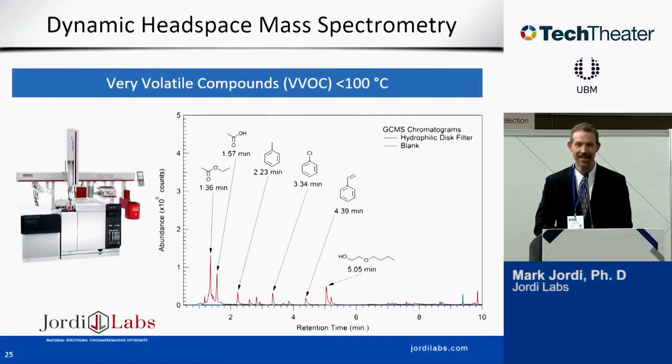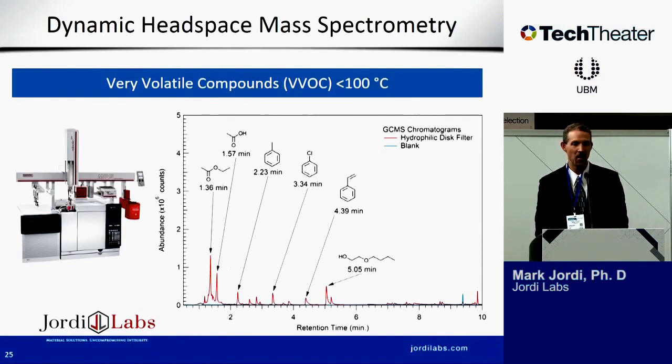Go back one more, please. Thank you. And then now we began to do our individual, more sensitive methods to look for individual extractables and leachables. And this is an example of the dynamic headspace results.